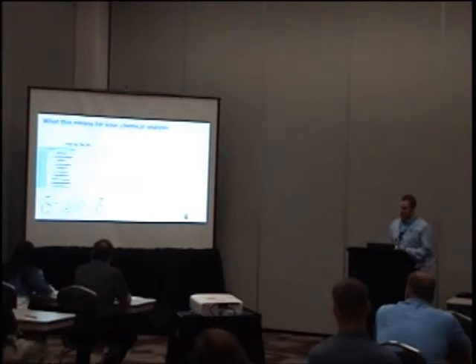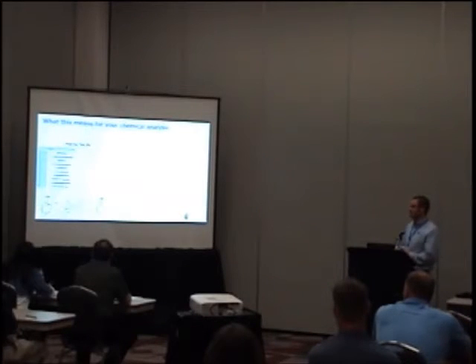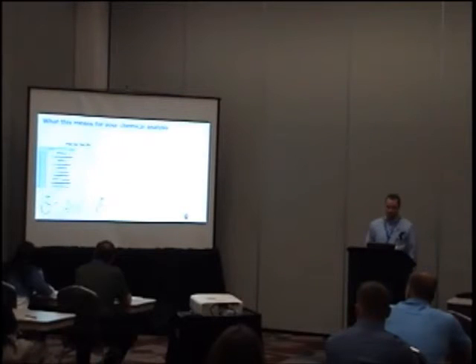Well, to do that, I want to take a look at the standard test mixture which you can purchase from many chemical vendors, many of which are at this conference. So I'm looking at this polar iso test mix, which I chose because it has a number of different compounds that have different functionalities and also carbon contents. So we have alcohol, chlorine groups, amines, and some esters here.